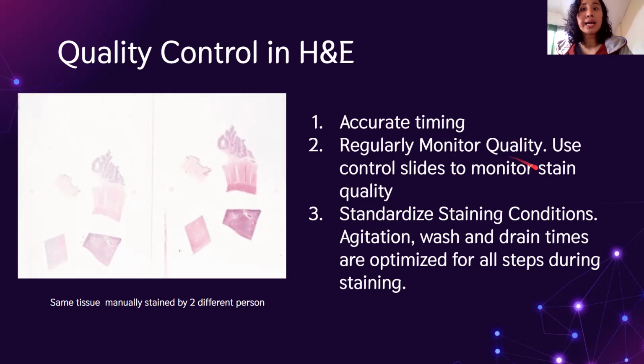Okay? And guys, ito, mahalaga to. Use control slides to monitor the stain. Okay? So, example, meron ng mga slides na nakastore sa laboratory. And every day or sabihin natin 3 days, you are checking kung yung quality ng H&E stain nyo. Kasi guys, you could reuse these stains, your reagents, okay? However, you have to replace it if nagiging light na yung stain, hindi na maganda yung quality ng results, okay? So as a good quality measure, kailangan may control slides ka.